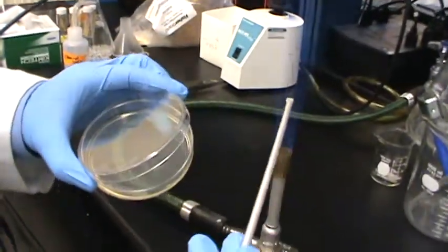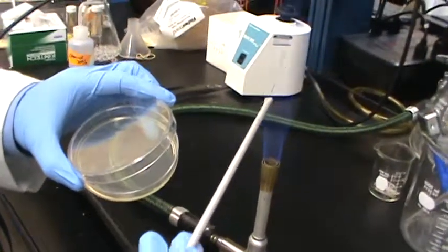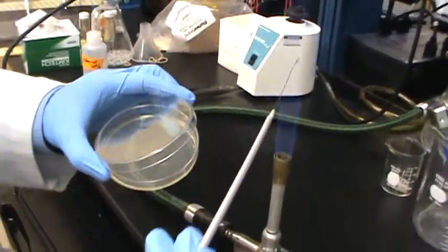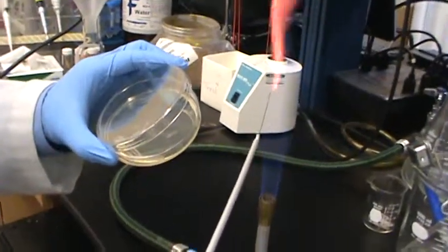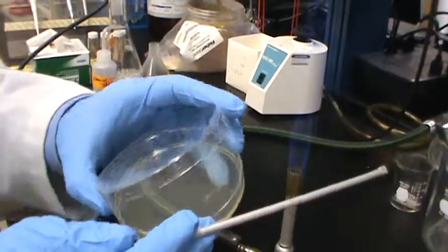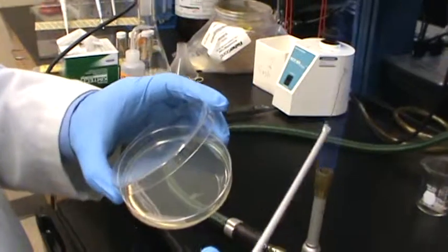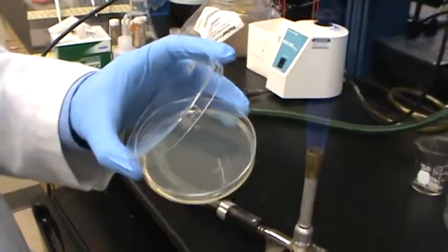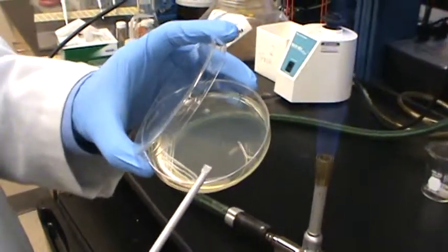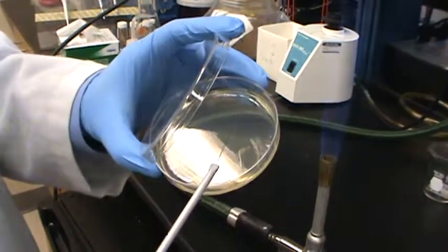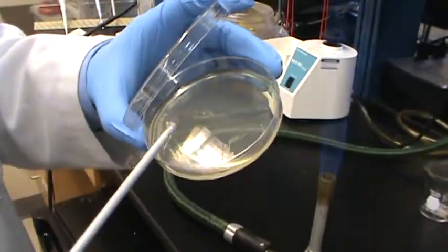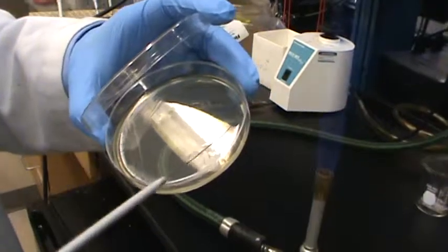Since this is going to be the last streak, I'm going to burn it and make sure it doesn't have any previous cells. This time I'm going to try to spread all over the plate. I'll cool the loop first to make sure it doesn't burn the cells.